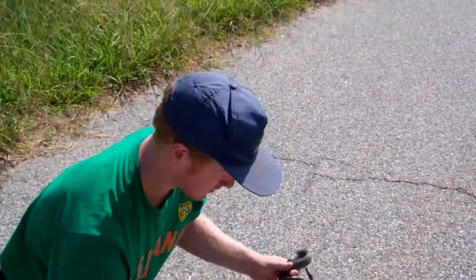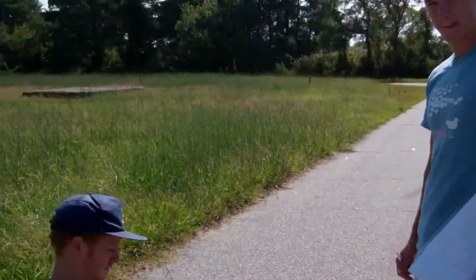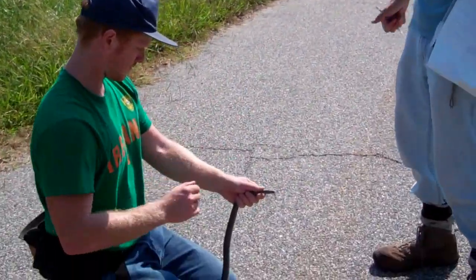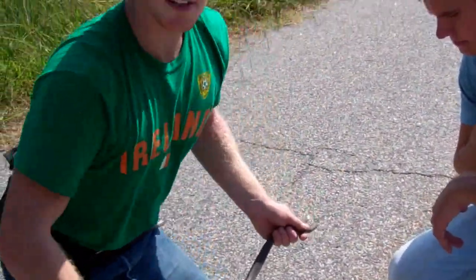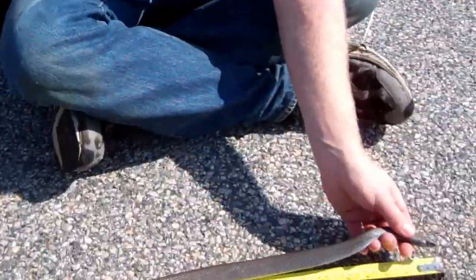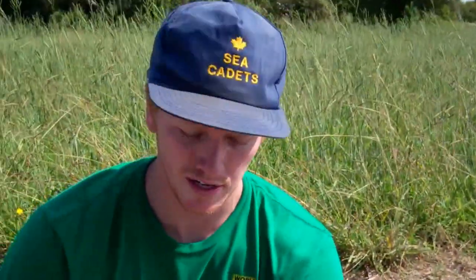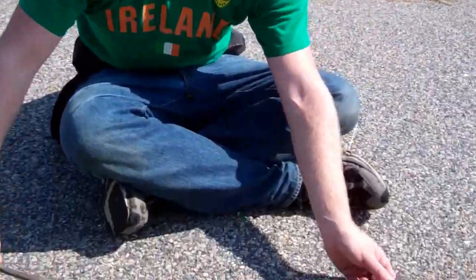Alright, so we are here on Wallops Island with Danny and Ben. They are grad students from Shippensburg University. And how about you tell us what you're doing as you do it. So right now we're measuring the snout-vent length of the black racer that we just caught over here underneath the board.